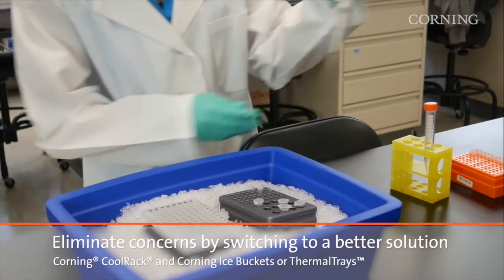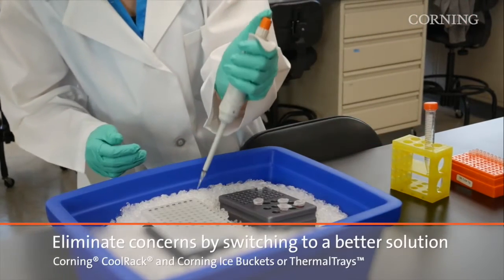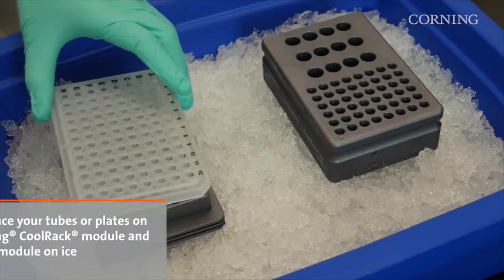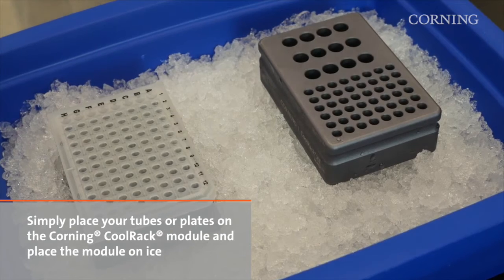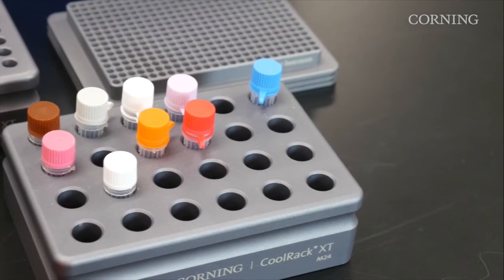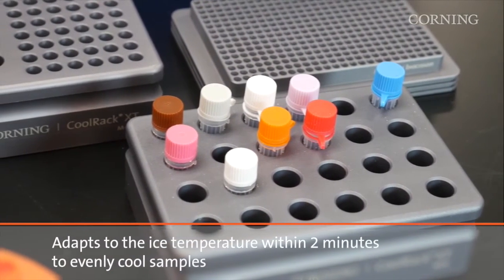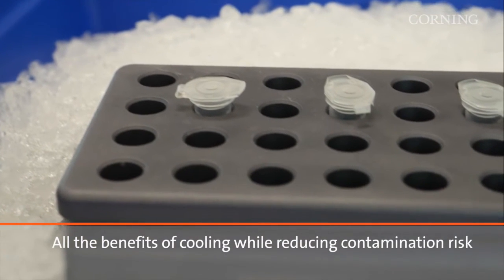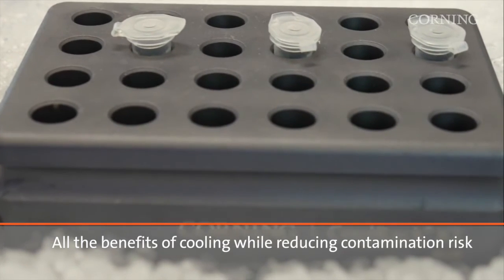To help eliminate some of the concerns of the standard method, you can switch to a better solution by using a Corning ice bucket or tray with Corning CoolRack thermoconductive modules. You can place your tubes or plates onto the CoolRack module and then place the module directly onto ice. CoolRack is thermoconductive, so it will adapt to the ice temperature within two minutes and will evenly cool your tubes or plates. The tubes and plates get the benefit of the cool temperature without the messiness and contamination risk involved with ice.